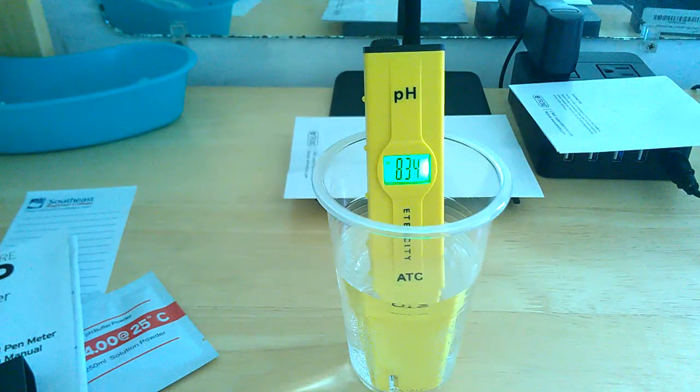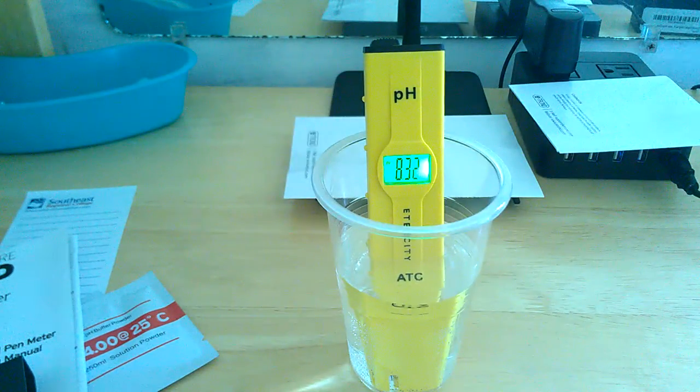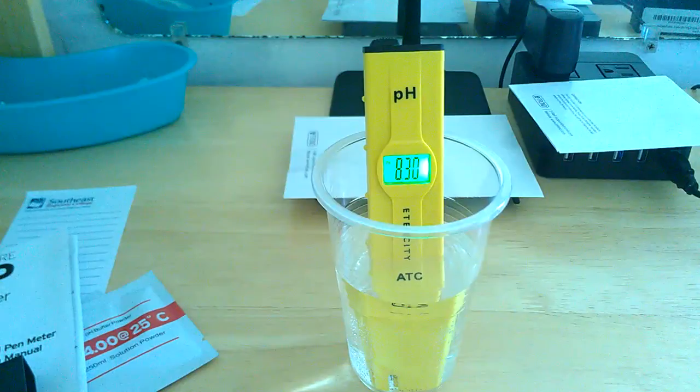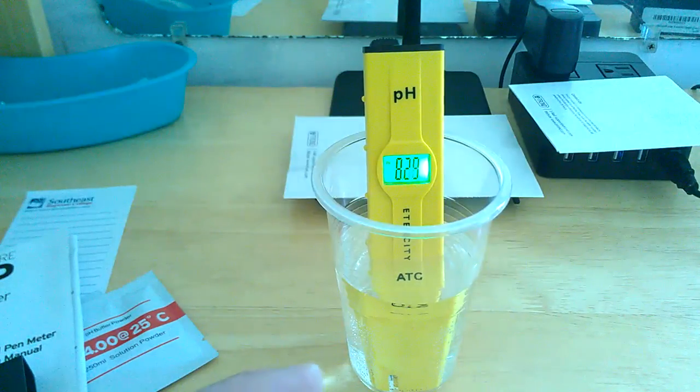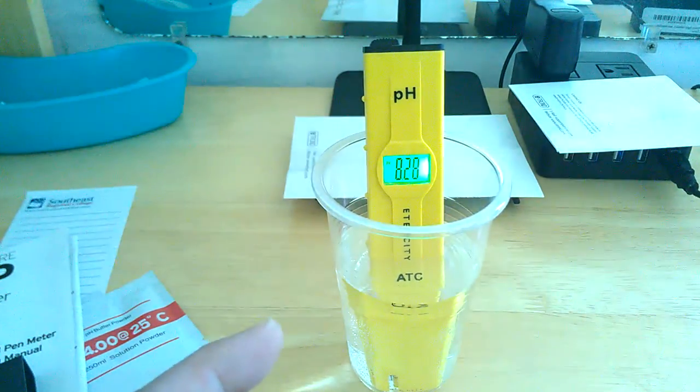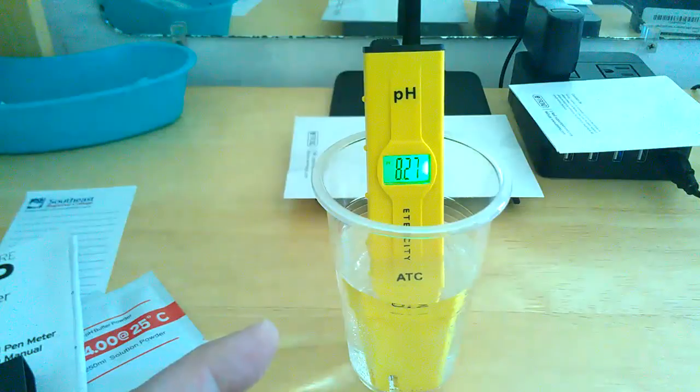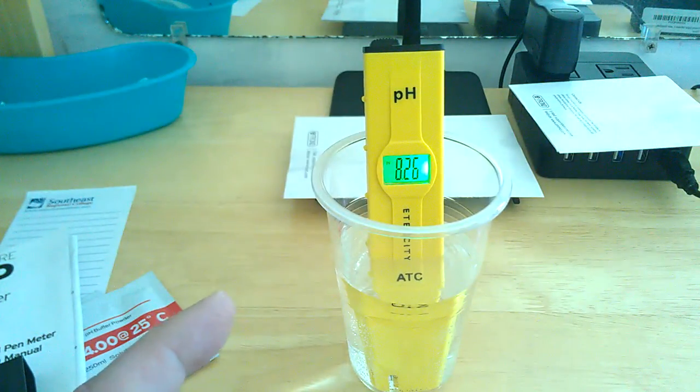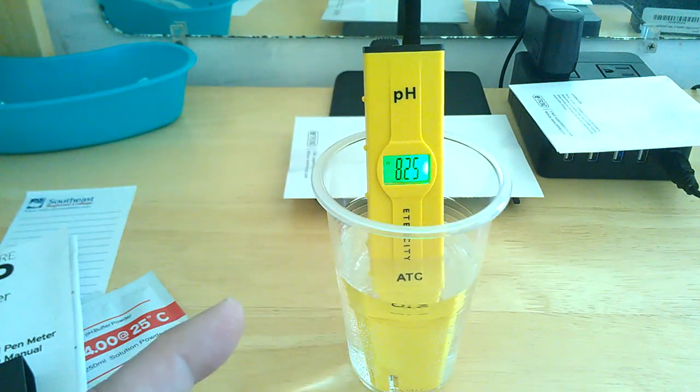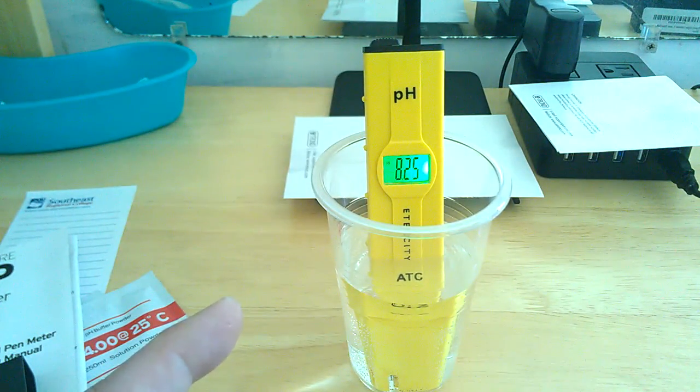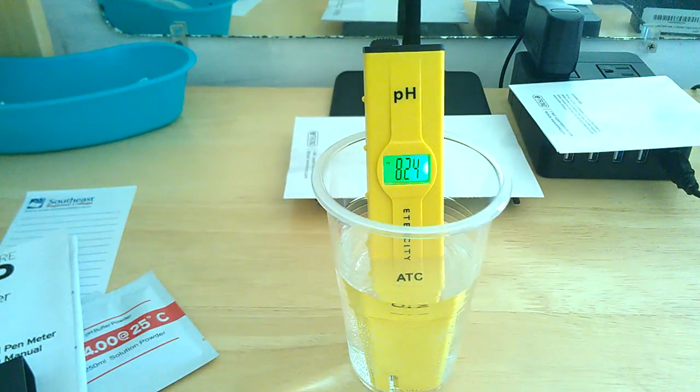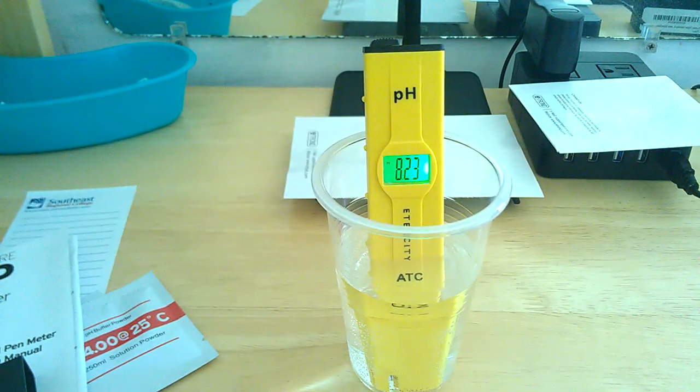And right now it's showing 8.33. That's the alkalinity level, your pH level of your water. This is just tap water. It's starting to come down a little bit. You do wait a little while and let it stabilize. And once it stabilizes that's your reading. It's that simple.